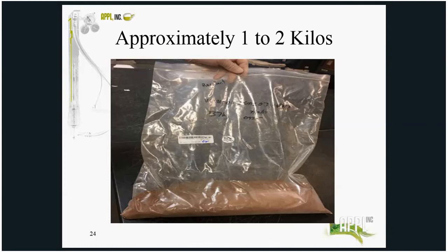And keep in mind too that if samples are larger than 2 kilograms, they may incur an additional preparation charge depending on the size and what have you of the laboratory's equipment. So make sure you have a good understanding with the laboratory for cost and sample size.